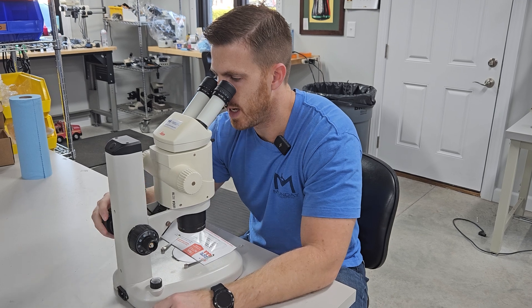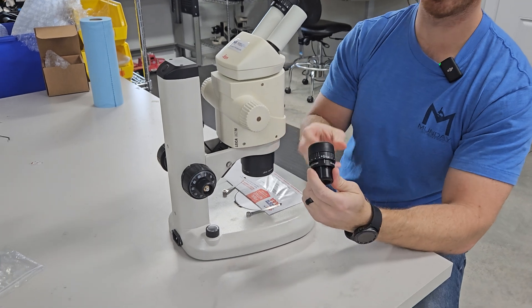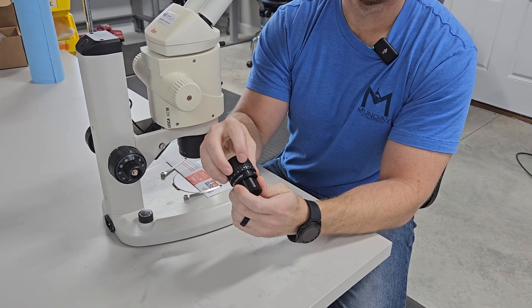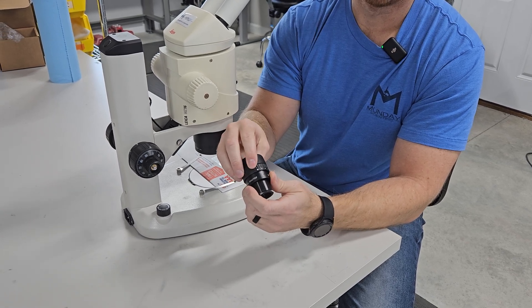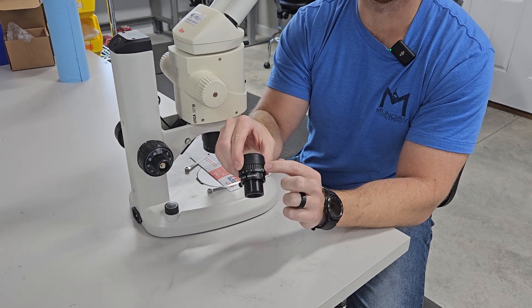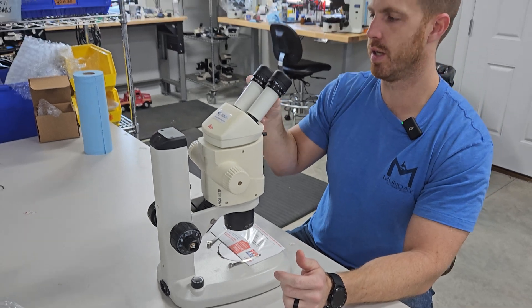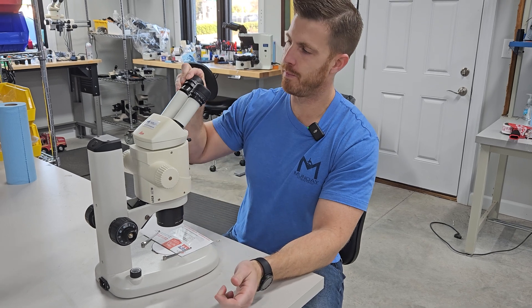Once the specimen is in focus at top magnification, we're going to make sure the eyepieces are zeroed out. The eyepieces have a diopter tube that changes the focus for your eyes. This here is a preset and this here is your zero feature. If you have 20/20 vision you'll want to align these two up — there might be a plus five or negative five number, but you want to make sure both are on zero. If you don't have 20/20 vision, you'll need to adjust a little bit.